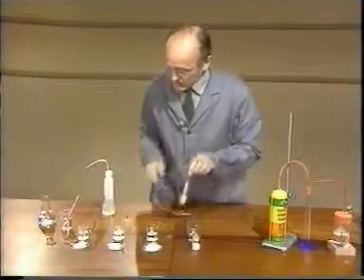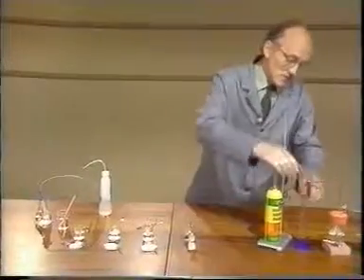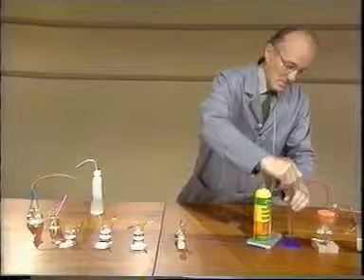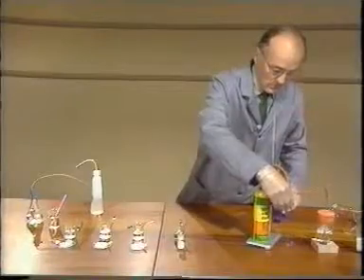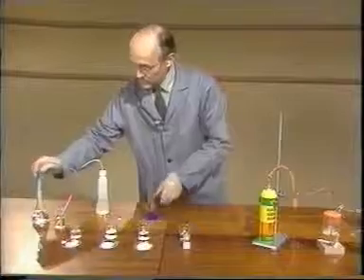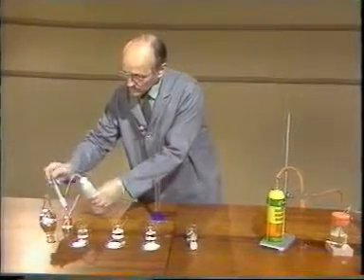For the sulfur dioxide, I'll have to disconnect this bung. And move the cylinder over here. Rinse the probe.